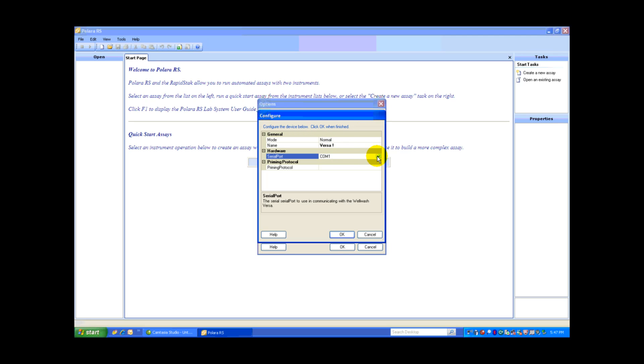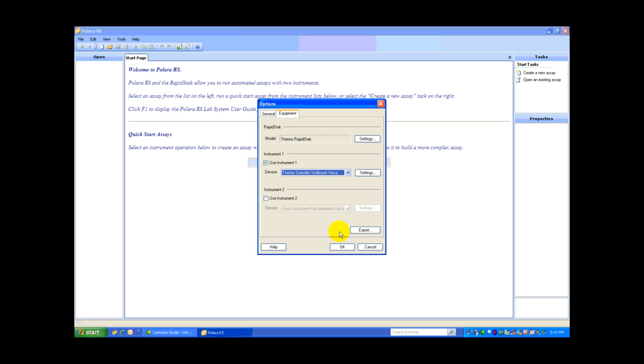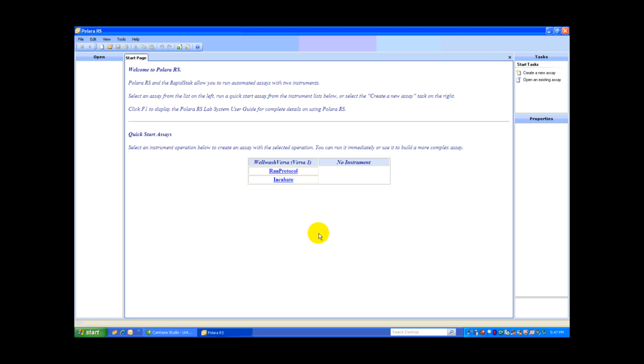I need to give my Versa a name. I'll call it Versa 1, and I have to identify the COM port. The Versa is on COM 9. And I select OK, and OK. You can see here that the WellWash Versa has been added to our system. I could add another instrument, but for this demonstration, I'm going to stay with just the Versa.